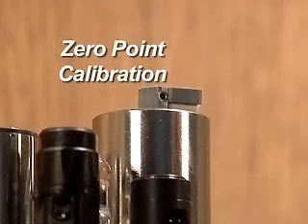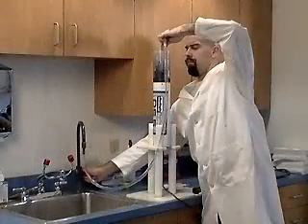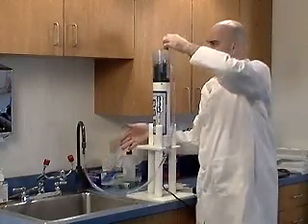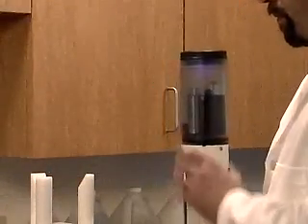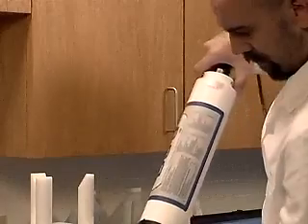Zero-Point Calibration. With the sensors pointed upwards, fill the storage cup approximately 75% with deionized water, or less than 0.1 NTU StableCal, and screw the storage cap on tightly. Slowly turn the sonde over so the sensors point downwards.